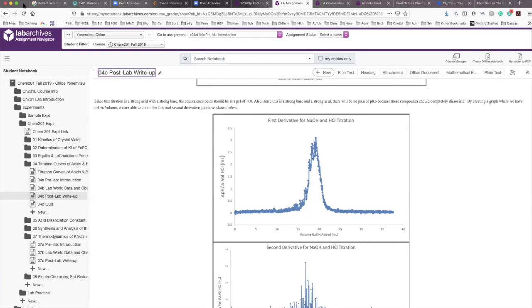And then of course you have to edit and correct any misspelling. But that's the versatility of LabArchives, is that you can use your device, whether it be a computer or smart tablet or your phone, you could actually dictate into it, and then it'll be translated through the dictation program that you have in your phone into LabArchives.